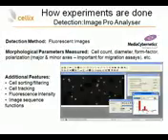During the assay, images of adherent platelets and aggregated platelets are taken, which can subsequently be analyzed by an analysis program. In this case, we recommend Image-Pro Analyzer from Media Cybernetics. It can detect aggregates and cells from fluorescent images and count cells, giving information about diameter, form factor and polarization of cells and aggregates. You can also sort the cells and aggregates, and it can provide information on the fluorescent intensity of a specific aggregate.